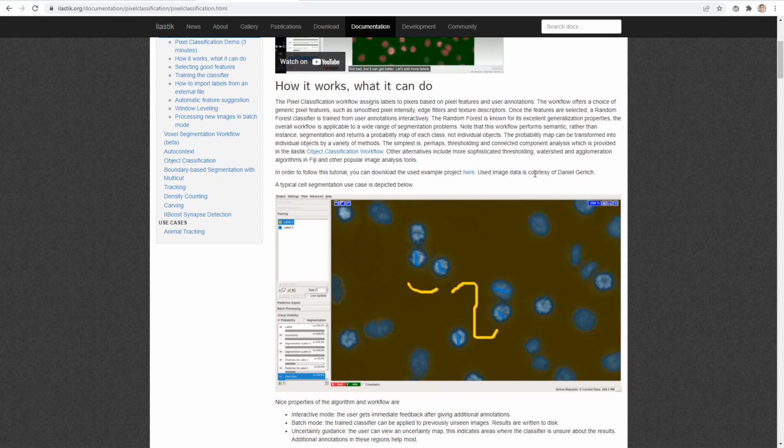The pixel classification or segmentation tool of Ilastik is quite similar to the texture classification tool that we used in Avizo. In general, we specify a manually selected, or let's say sparse, selection of segmentation for our labels, as you can see here. Then this serves as input to the learning process that tries to learn a classification model that would then be able to discriminate the different materials in our data.